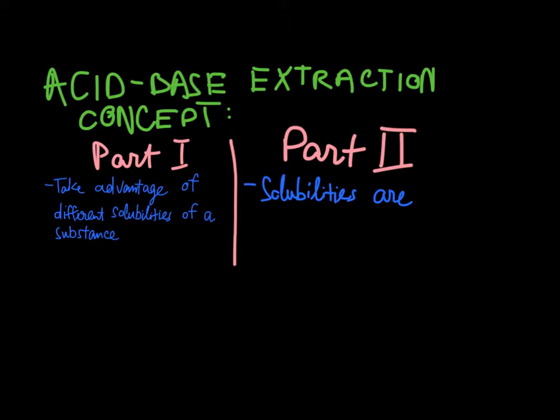In other words, we took advantage of the ability of the substance to dissolve in different solutions to extract it from the mixture.